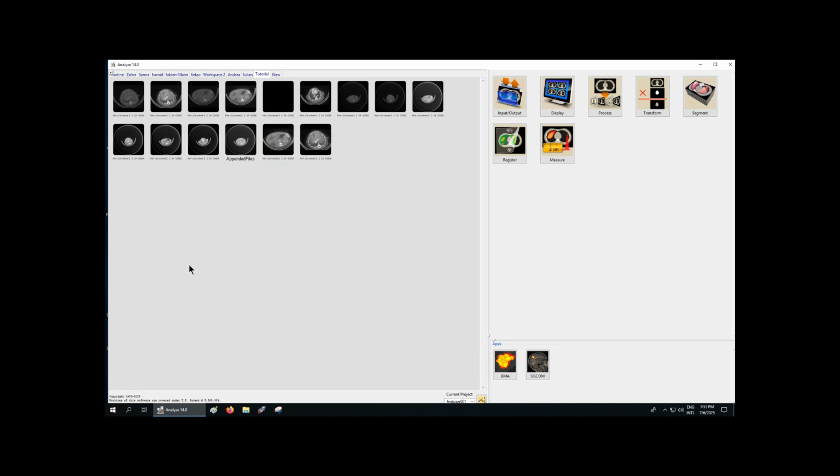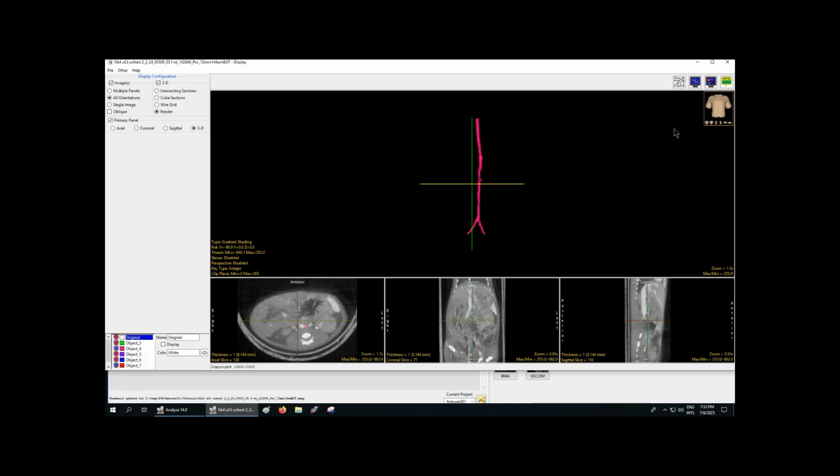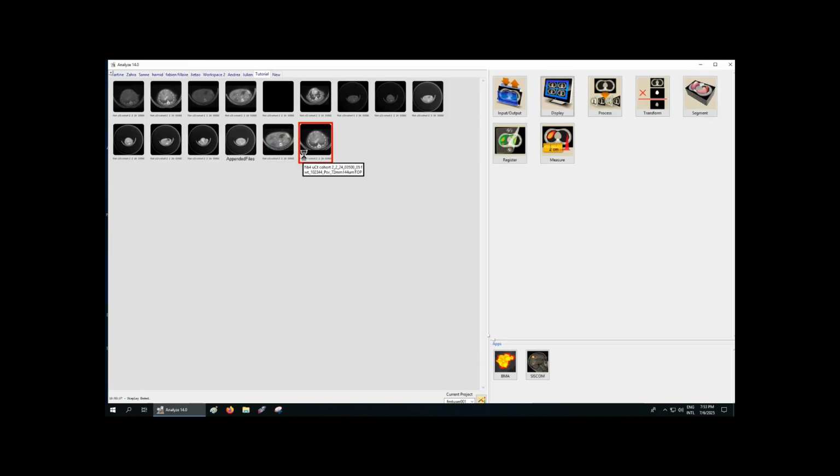As I've already stated, it's a lot easier to start segmenting once you've already stitched both files together. But in some cases, you could have accidentally started segmenting both of them separately and then found out later. Anyways, here I have both the top and bottom files completely segmented. This is the bottom file, and this is the top file.